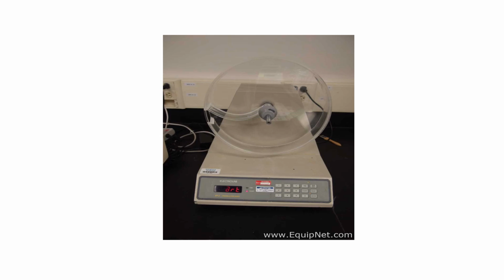It is a cylindrical apparatus. The tablets are placed here, and while operating this equipment, the tablets will be rotating, and at the time of rotation they will fall from a height of 6 inches. So the tablets we place here, while rotating, will come down.